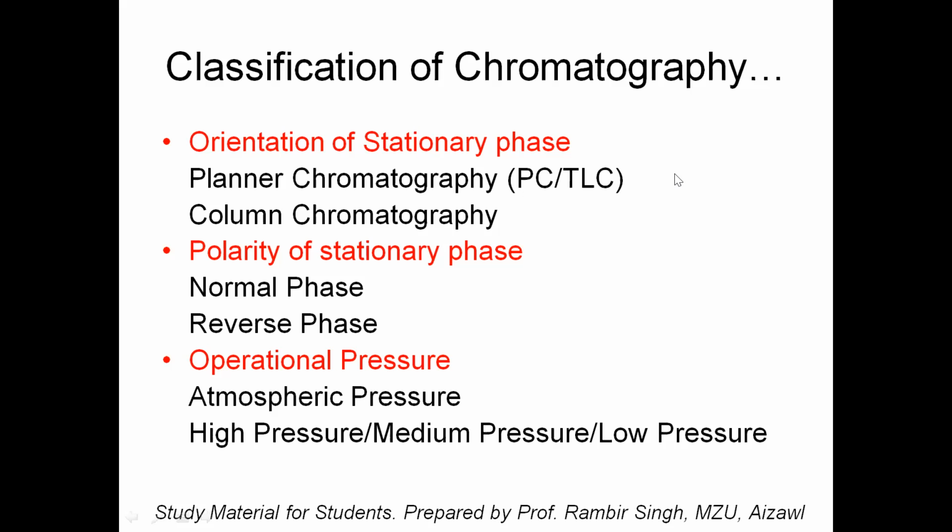So for that, what was done is that the polarity of the stationary phase was changed from polar to non-polar. And nowadays, we have modified phases where on silica gel itself, we did the carbon loading.